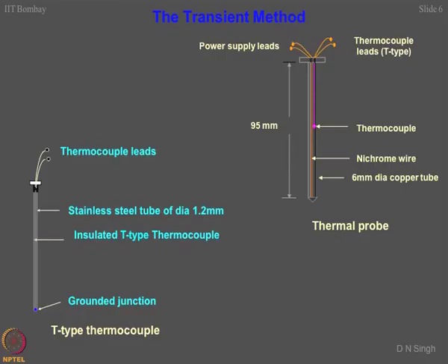So, what's the transient method? The transient method is based on a probe like this. The basic intention of showing you all these techniques is to make you realize that people like you have done all this few years back. Okay?